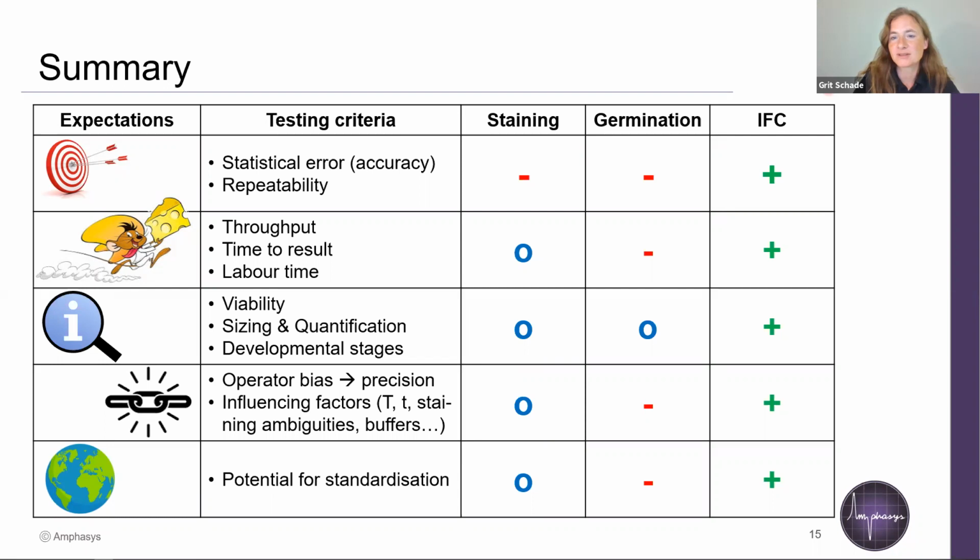Okay, good. Around that number you can do if you are preparing your experiment accordingly. I think here it's important that you also test in advance how many you can do, that you look for buffer stability and how you have to prepare the samples. But this you also will see in the other sessions, as well as in my session and Philip's session on Thursday. And of course, if you need the time for doing something else and your measurement is stable enough, you can also use an auto sampler, which is basically a walk-away solution so that you can focus on other things as well.